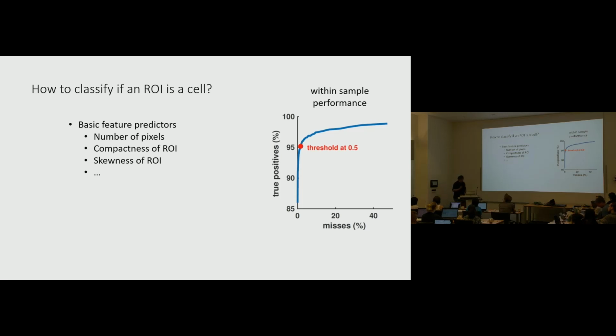Yeah, right. So we get this question a lot. I think the right thing to do is not to ask the same algorithm to give you those ROIs, but to run an anatomical algorithm on the red channel, for example. That's the way, because really all you can do is estimate how many cells were completely inactive. So you've got your algorithm that gives you all the cells, and now you have your algorithm that gives you all the functionally active cells. And so now you can compare those two numbers.